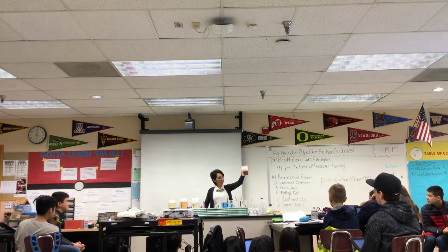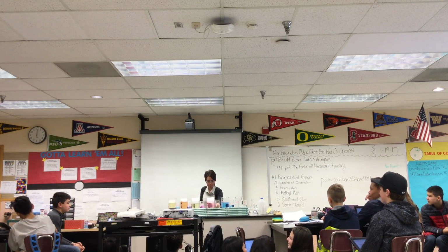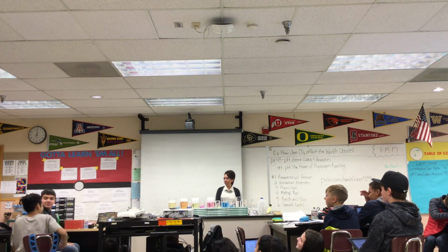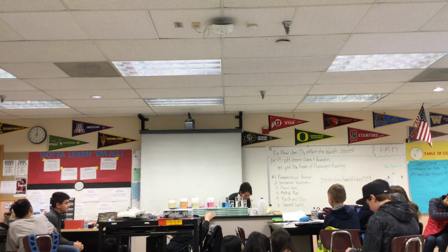Whoa. This one went really, really fast, right? So there we go. There's our nice color. I was looking away, and then when I look back, it's still changed. It's magic, right? All right, our last one is bromothymol blue.